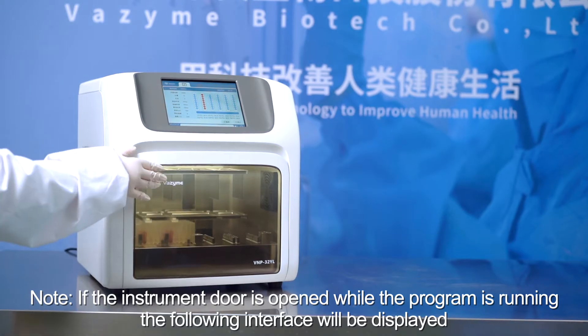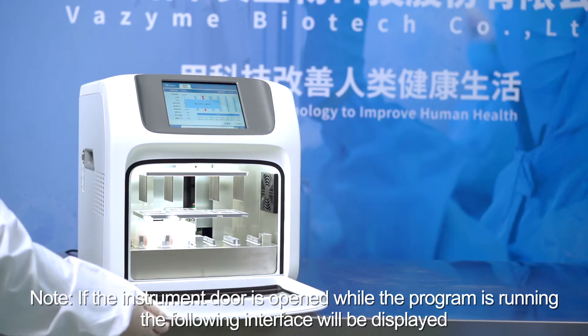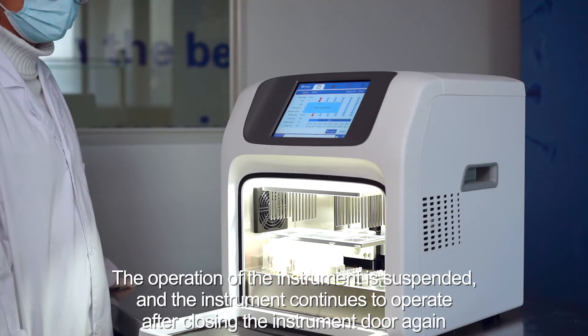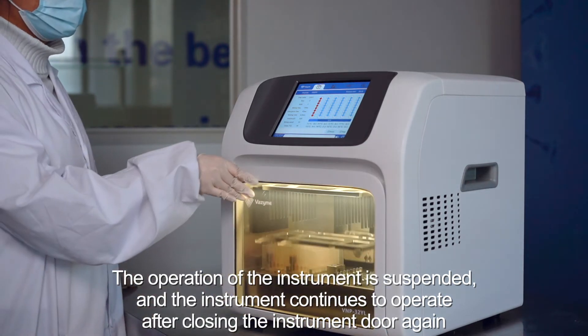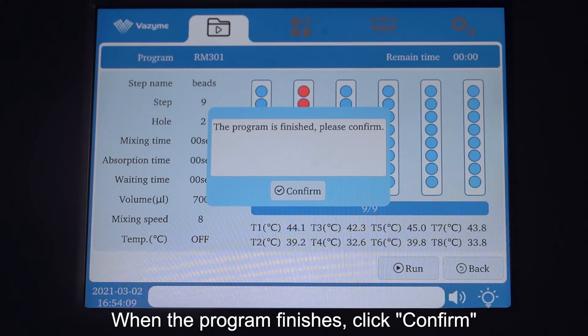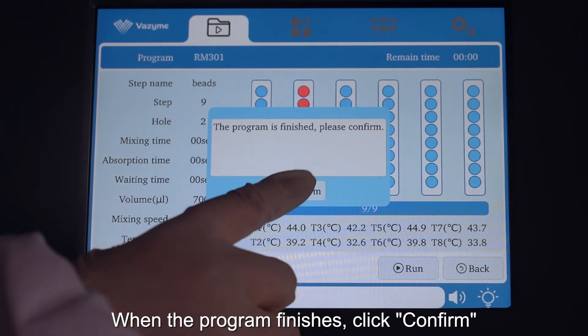Note: if the instrument door is opened while the program is running, a warning interface will be displayed. The operation of the instrument is suspended and will continue to operate after closing the instrument door again. When the program finishes, click confirm.